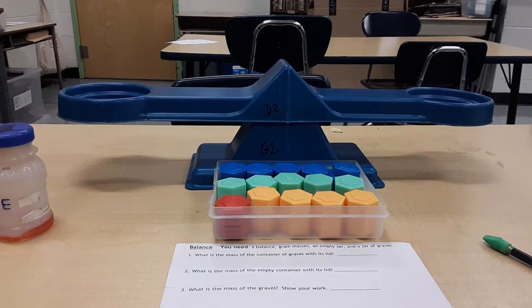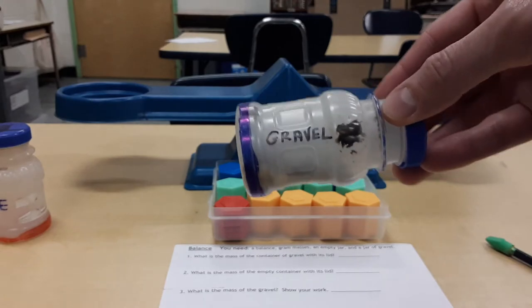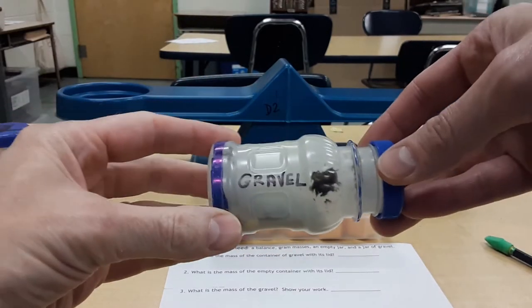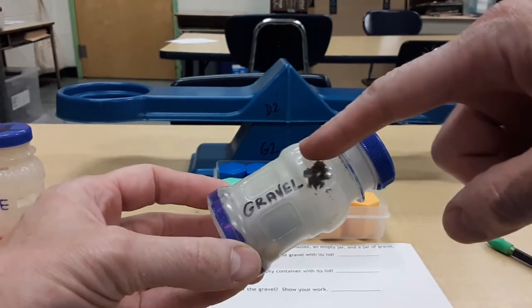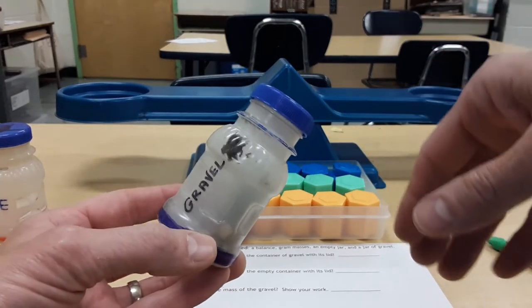How to find the mass of a substance in a container. There are always the same three steps. We want to find out what the mass is of the gravel that's inside here, but to measure that, the first step is going to be measuring the gravel in the container and with the lid. Why do we say the gravel and the container and the lid? Because they all have mass. They'll all add up to something.